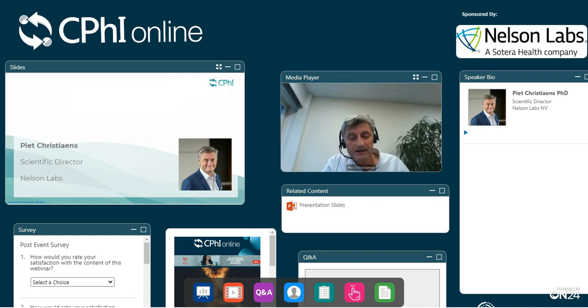Nelson Labs Europe is a CRO that is specialized in performing extractables and leachable studies for a wide variety of drug products as well as for medical devices. And today I will talk about the necessity of extractable and leachable qualifications for primary packaging of lyophilized drug products. And I will try to explain a little bit more in detail why there is such a debate around the depth of extractable and leachable qualifications.